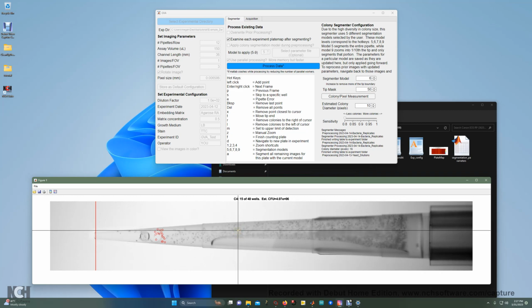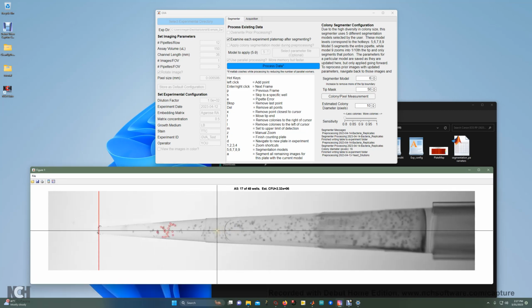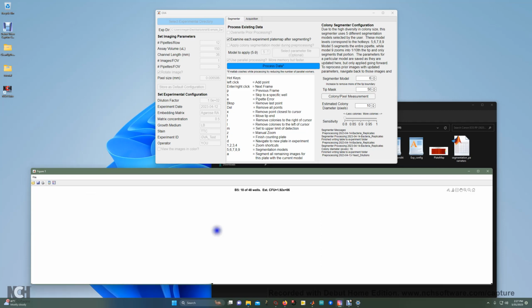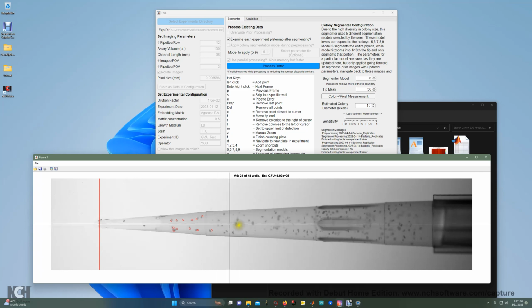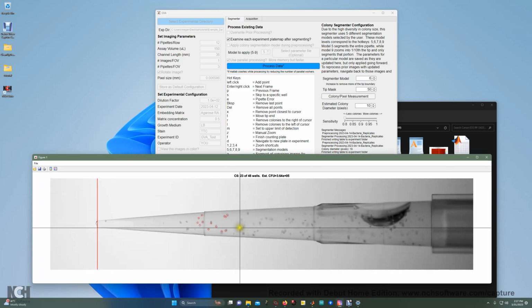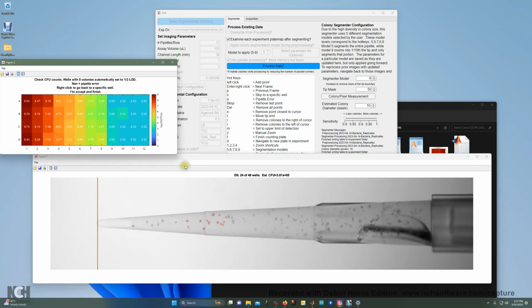You will have some error due to changes in volume, but they can be overcome just by the amount of information encoded in the position of the colonies. So now the colonies are bigger and easier to find as you go down and dilute more and more dilutions. So if I click finish on this one, you can see the dilution series goes from 10 to the 9 all the way down to the limit of detection.